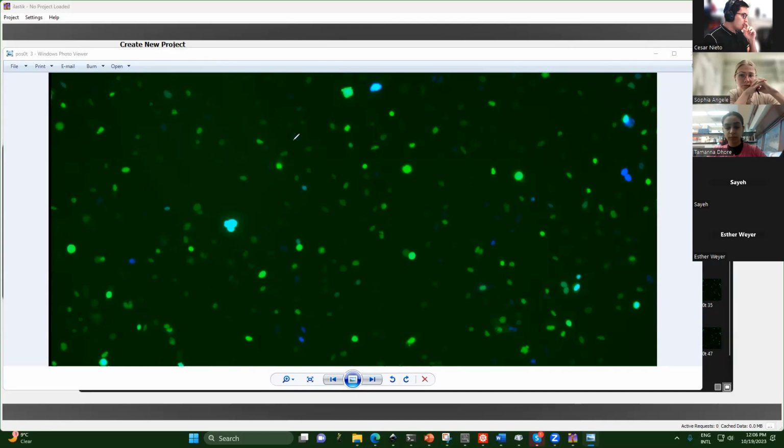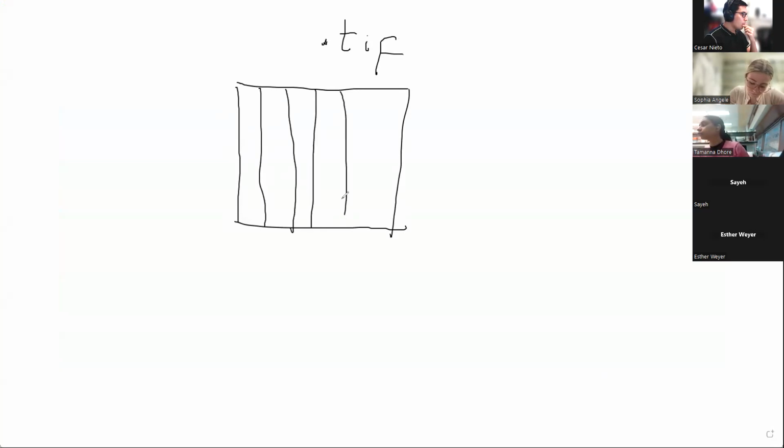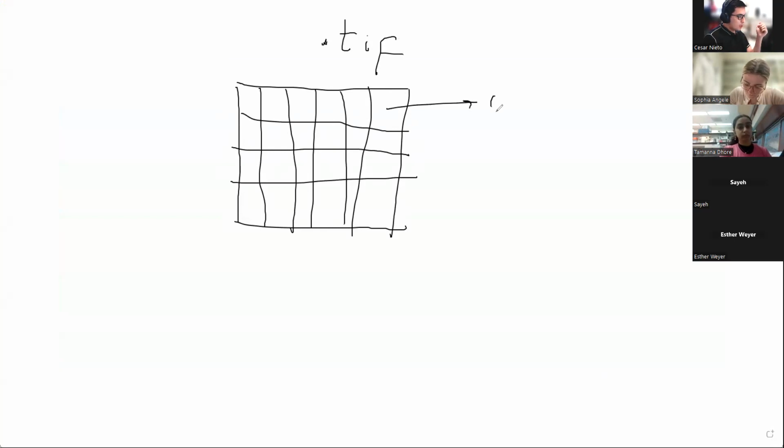the image is going to be, let me share the screen here. So in an image, for those that are not familiar with this extension, the image is an array, like a matrix, and each component corresponds to a pixel. So if you are RGB, you have a pixel of 3 elements, corresponding to red, green, and blue.